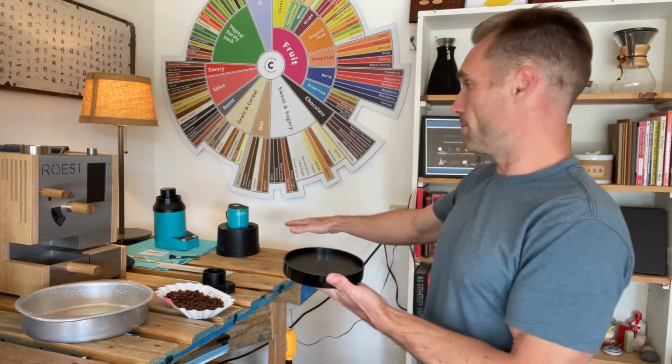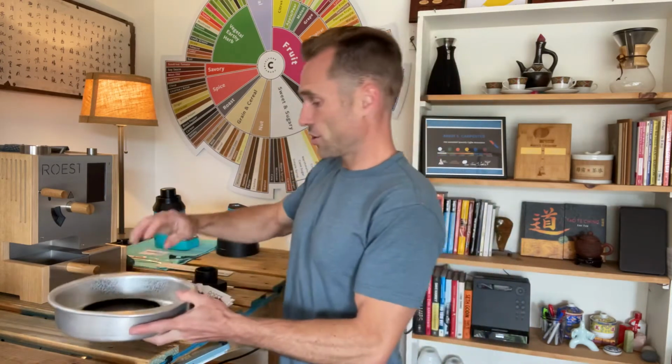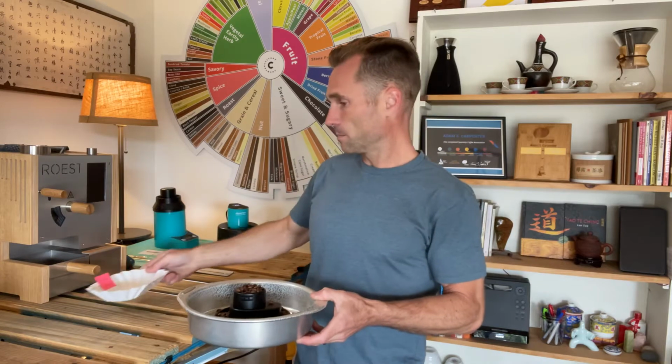What we're going to do is fill this up, and you want it to be level because you are measuring the light reflection, refraction, and so you don't want the surface to be curved or overflowing. The same is true with the ground coffee. So I'm going to place this into a pan. You can use any kind of a catching tray. I'm just going to fill this up, and then put that in there as well. Fill that up. So we can do this one easily.